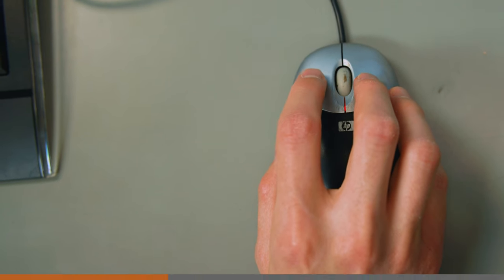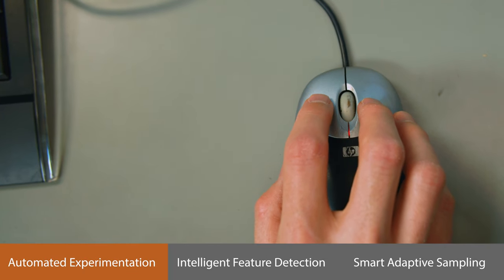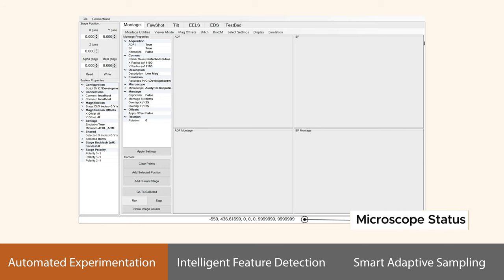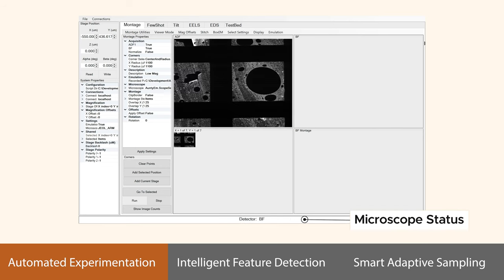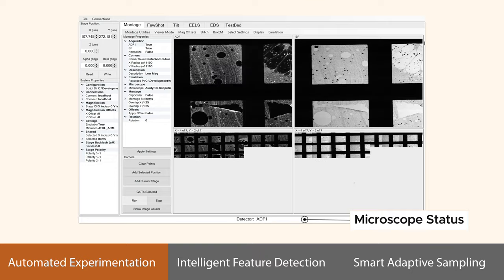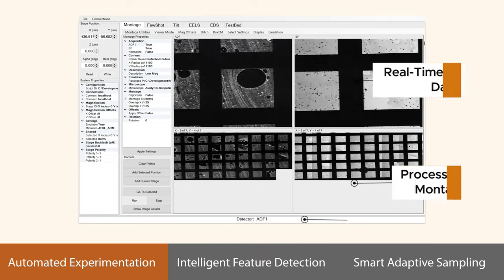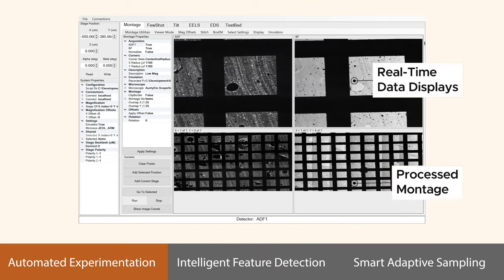When the user programs an experiment and clicks Run, the instrument begins automatically collecting data. The system meticulously processes, corrects, and curates data to ensure accurate and precise results.